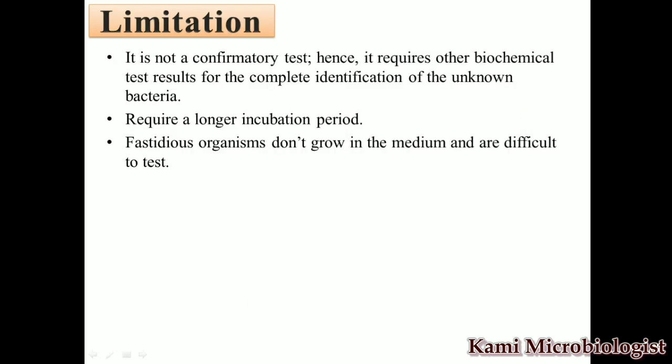Then we have the limitations. While identifying bacteria or bacterial species, you need to perform other biochemical tests, which is really necessary. It is not important that we depend on one test. Next, we require longer incubation in this test, and fastidious organisms cannot grow in this medium, so it is very difficult to find them.